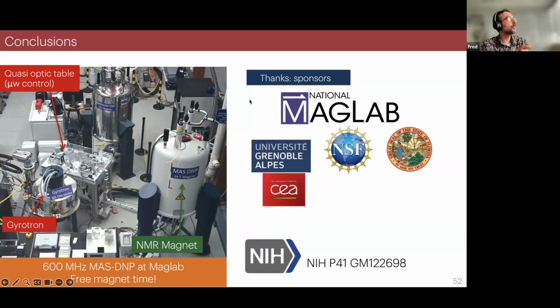Now, I do not think the electron relaxation times will be affected by the spinning, and therefore I tend to think that the static EPR at high field would be good. When it comes to nitroxide, whether you measure at 100 Kelvin, at X band, or at very high field, the only thing you will see is an anisotropy in the T1, but I would say the average value is the same across fields because the relaxation mechanism behind it is the same and is field independent.